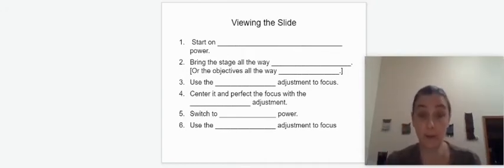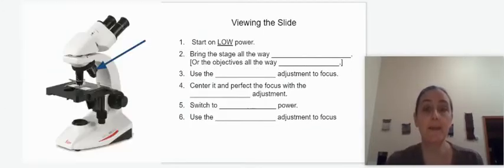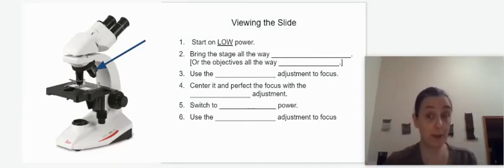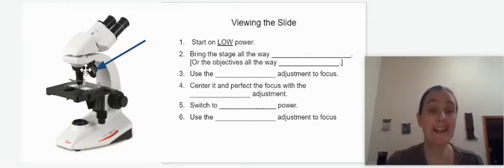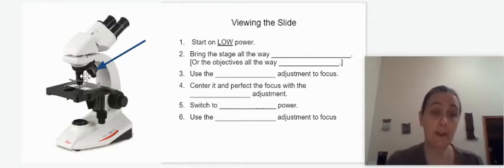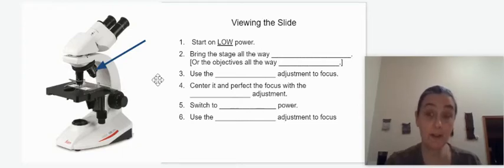When you go to use the microscope, there are some steps you absolutely have to follow. First of all, you always want to start on the lowest possible power. The reason is it helps you scan. Looking at these objectives, the shortest one is the lowest power — you would switch the nosepiece so that the shortest objective is in line.